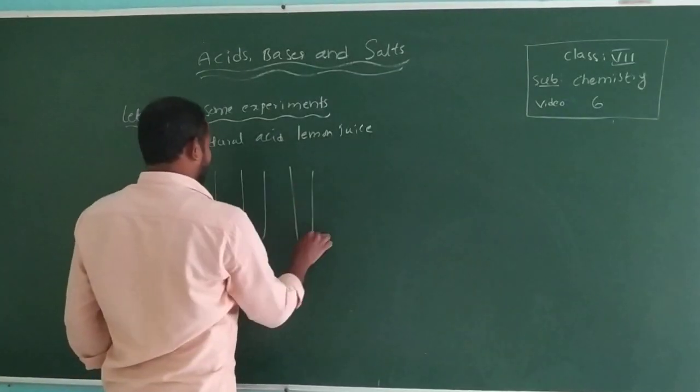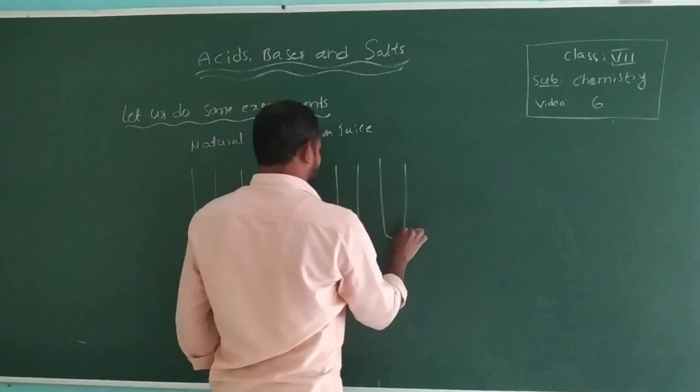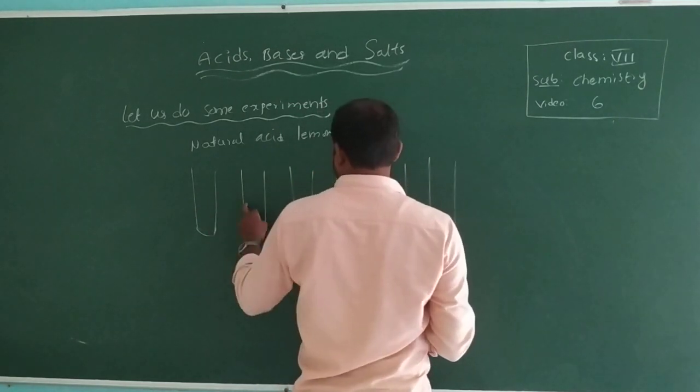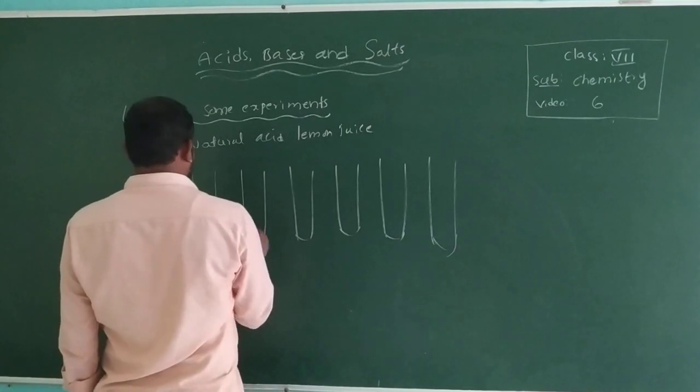Now, lemon juice we are taking in 6 test tubes.